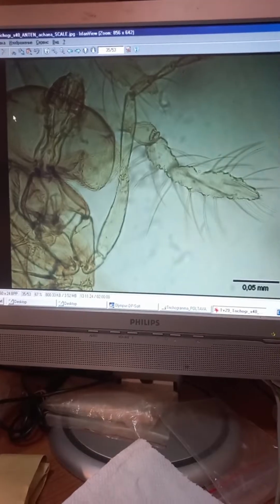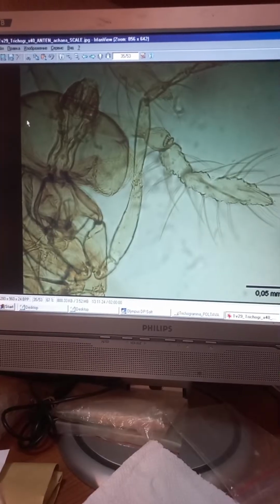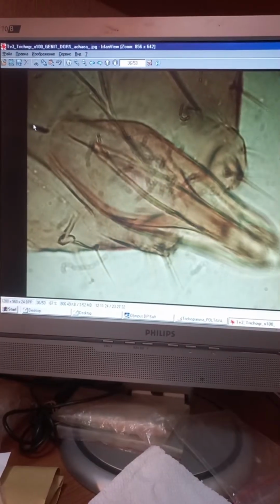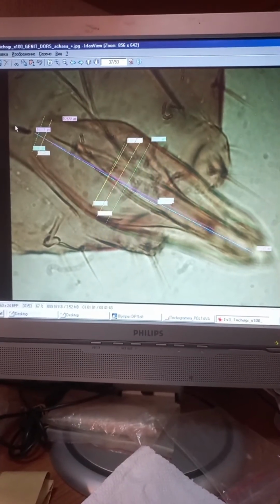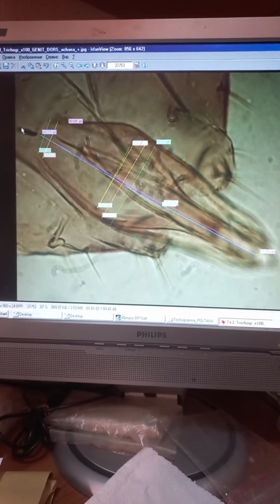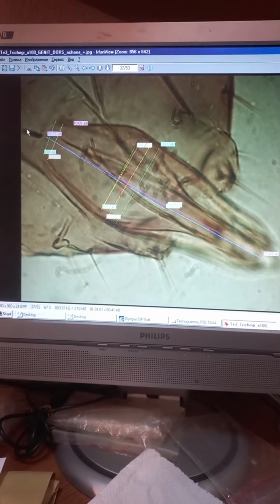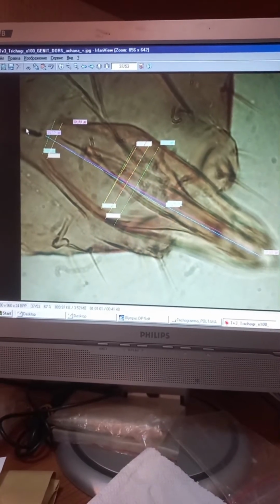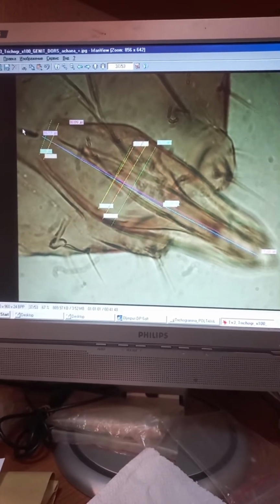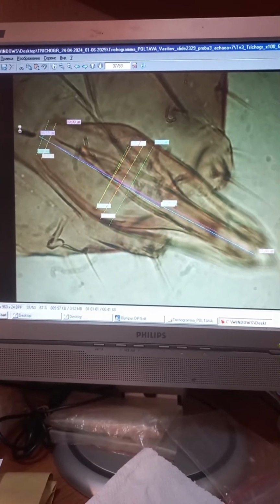Okay, here we see head and antenna under magnification 400. Male genitalia of Trichogramma achaeae. These are different measurements which can be done to study features of this species. So some length is indicated, and it is saved in the computer and saved on paper. So it is necessary to make some measurements for identification and to see the differences of different specimens.